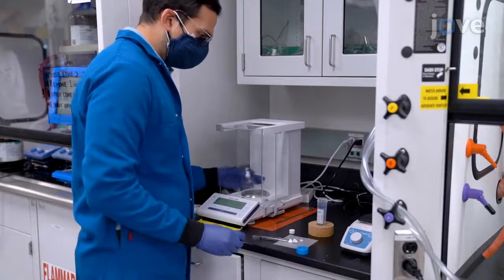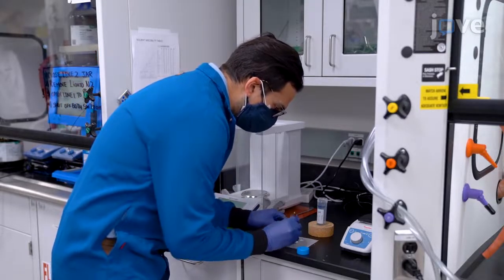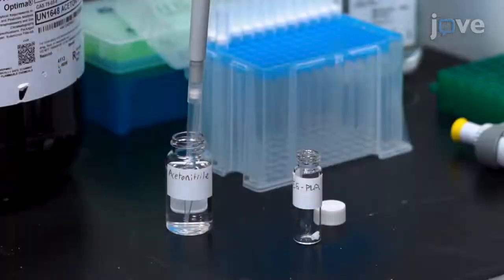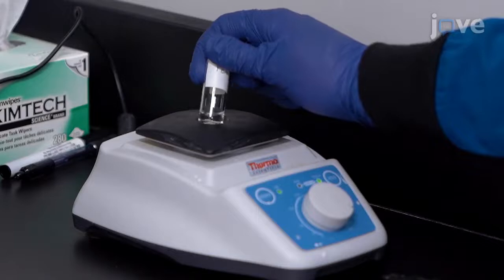To synthesize nanoparticles by nanoprecipitation, add 50 mg of PEG-PLA polymer to an 8 mL glass scintillation vial and add 1 mL of acetonitrile to the vial. Vortex to fully dissolve.